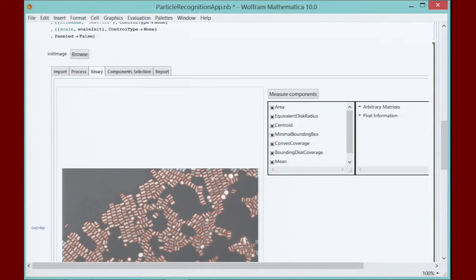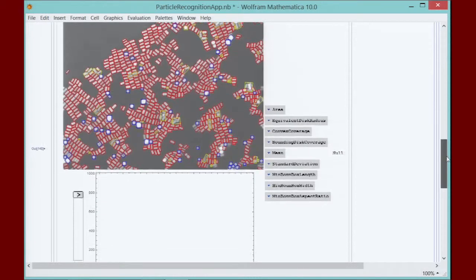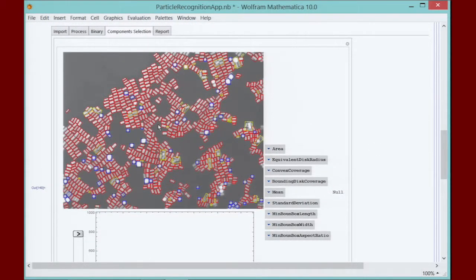I think there's something around 900 particles, so it takes a while. I've entered some number of properties. We can move to what is, in my opinion, the most important part, because there you can get the immediate feedback on the selection of your parameters.